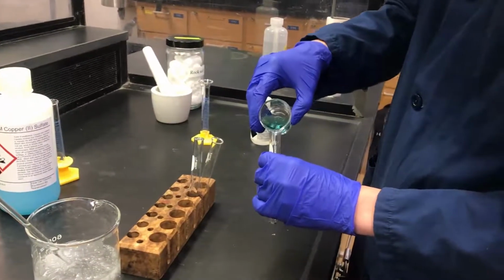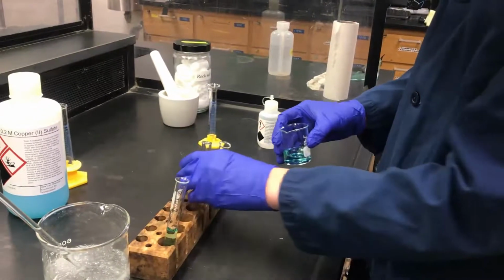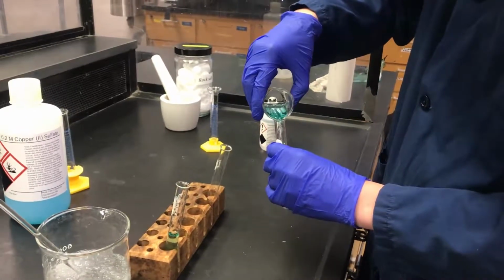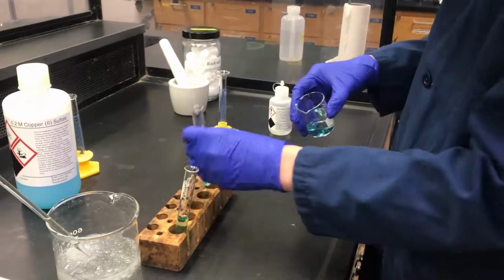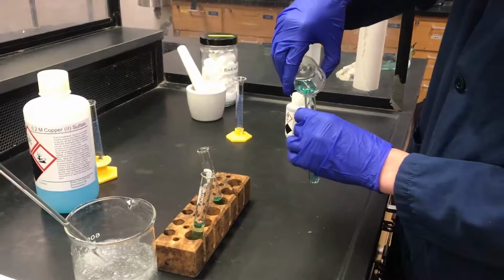We're going to distribute this evenly between the 3 test tubes. So one test tube will be our control. That will be untouched. The next will go into our ice bath. And then the last test tube will get into a hot water bath.